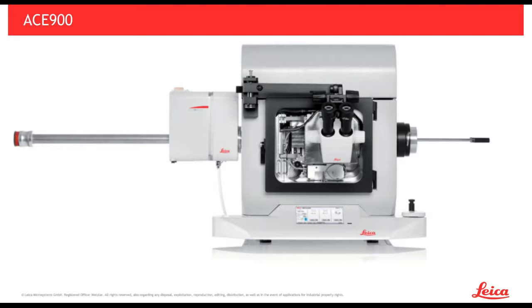Thanks, Evan. Our next question: how delicate are the replicas, and can etched samples be stored or transported? The replicas, when they're being floated on the bleach to remove the tissue, are extremely delicate. This is when you can easily lose the sample. The thicker the replica, the more likely it is to hold together, but also you'll get less detail. Once you've got them free of their tissue and collected onto EM grids, they are very robust and stable. You can keep them in a grid box for years and they'll be fine.